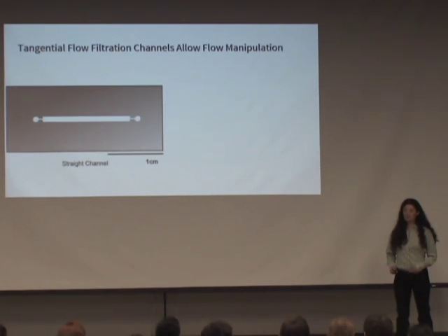Currently, microfluidics uses inertial focusing and inertial microfluidics to separate particles. This works, and it's cool, but it has limitations. Currently, the microfluidic devices need to be fabricated specifically for certain known cell sizes. And if you want to separate cells of different sizes, you have to fabricate an entirely new chip. This leads to inefficiencies in time as well as production costs.